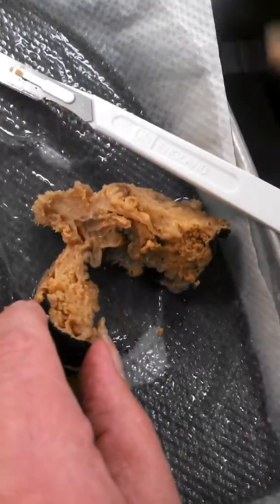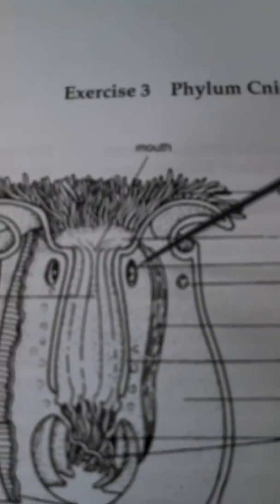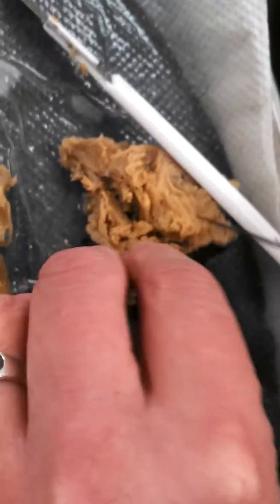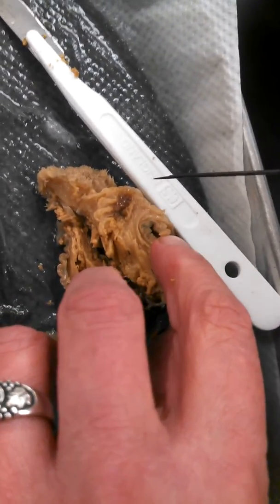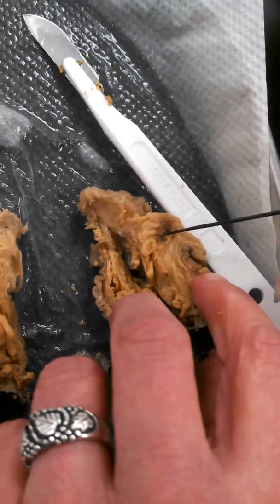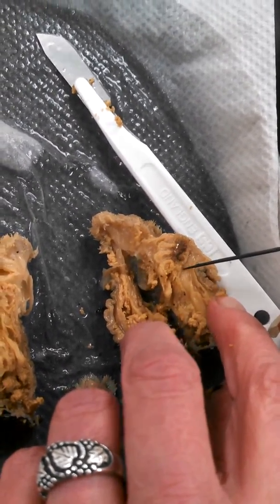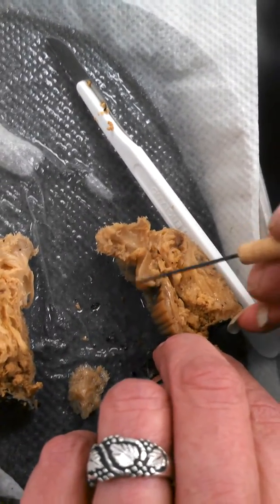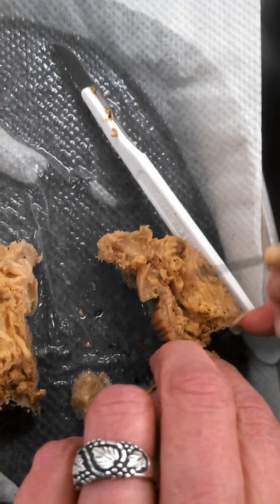I'm looking for this thing right here and I'm not finding it yet. We don't have to identify it, I don't think so. This looks like it's the marginal ostium, maybe. The fossa is this piece here — the fossa, I should say — in the parapet.